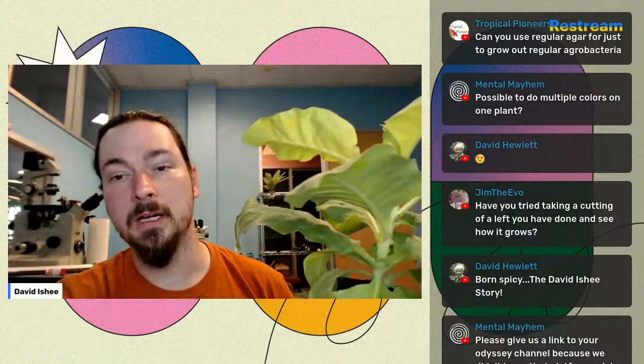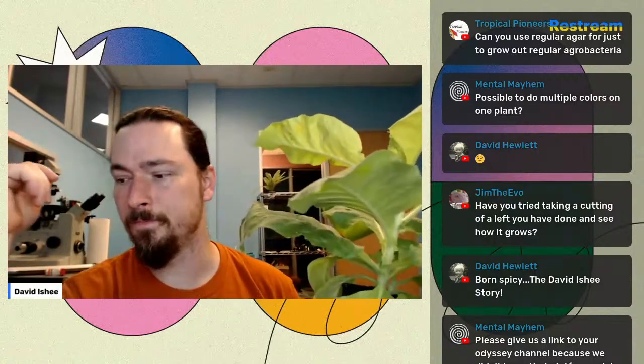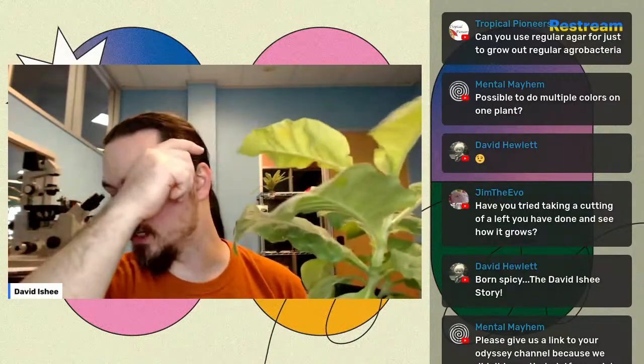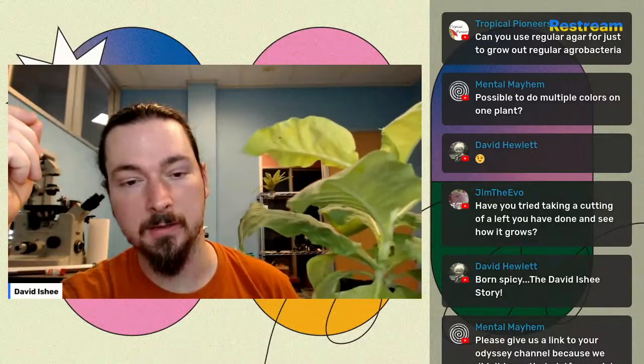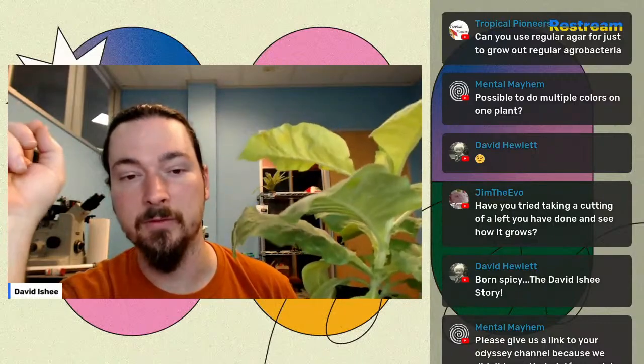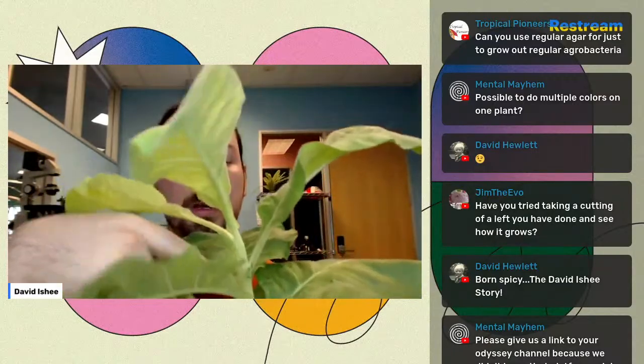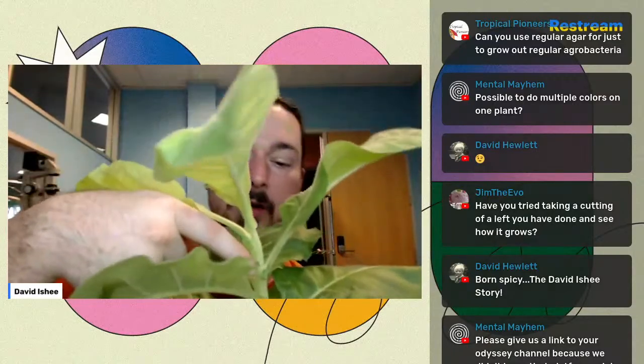Though I would recommend using some antibiotics to select for them. The strain that we're using has a genomic mutation that makes them antibiotic resistant, so you can select for them with that. But each node, inside the node, are cells.